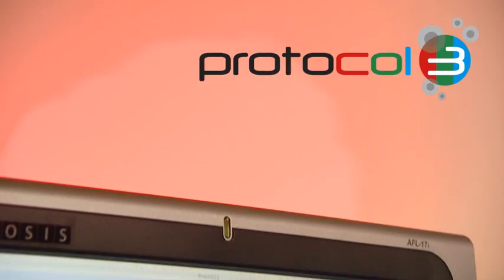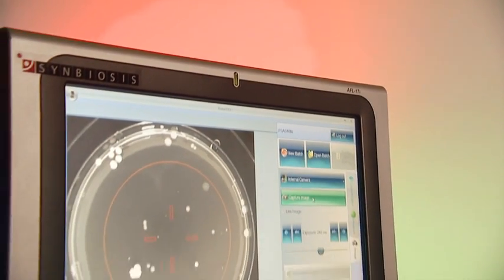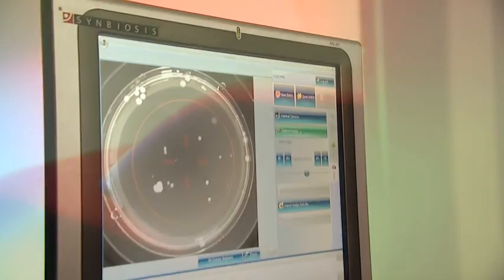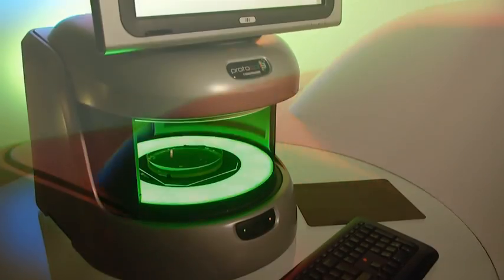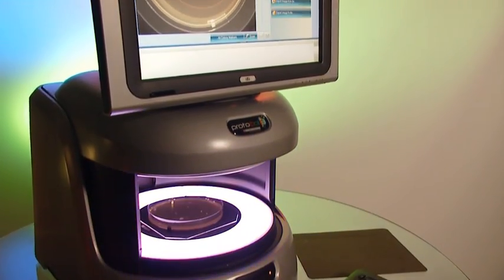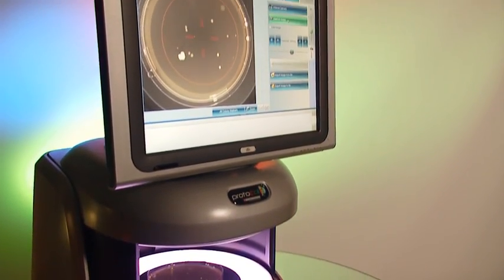Protocol 3, the next generation instrument for automated colony counting and zone measuring from Symbiosis.